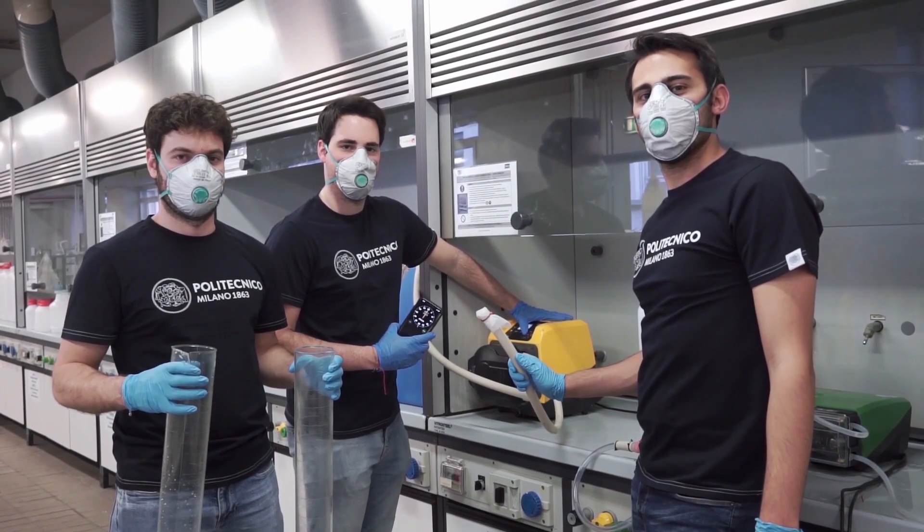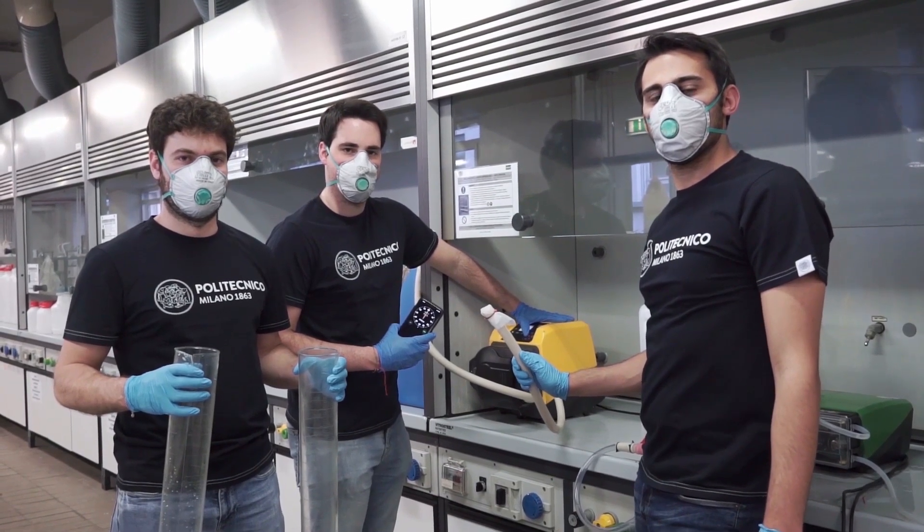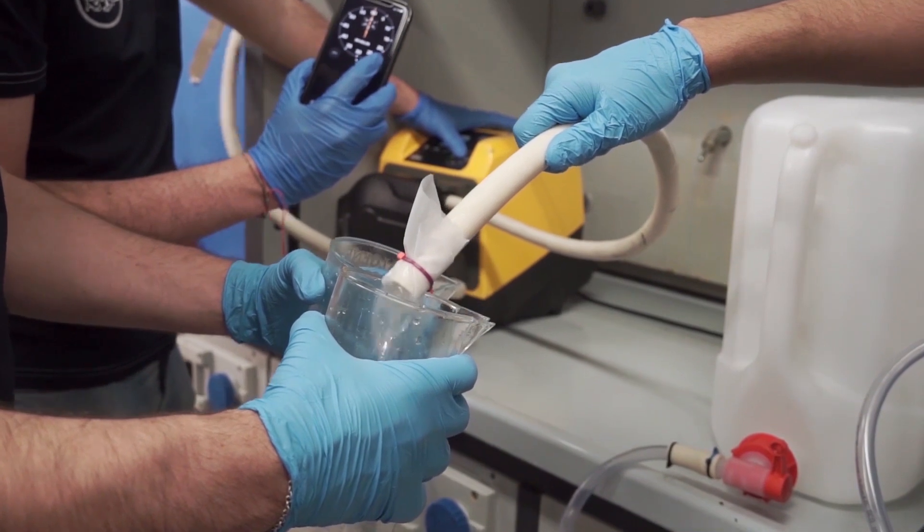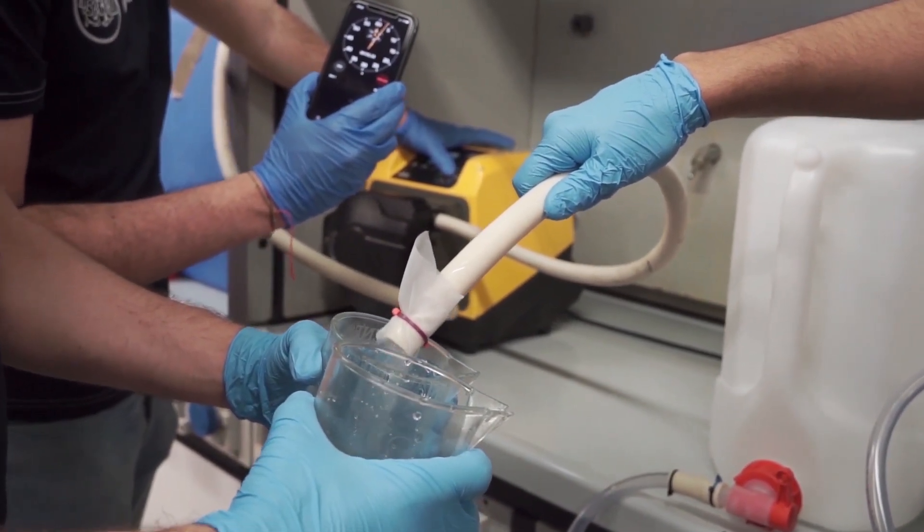Now, to proceed with the calibration, we will need at least three operators with two cylinders and one chronometer. At this point, proceed by measuring the volume you have in the cylinder during the time interval measured by the chronometer.